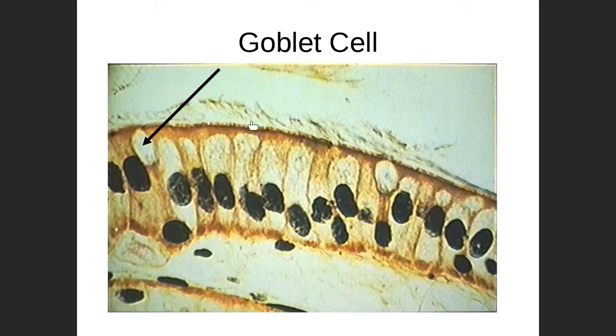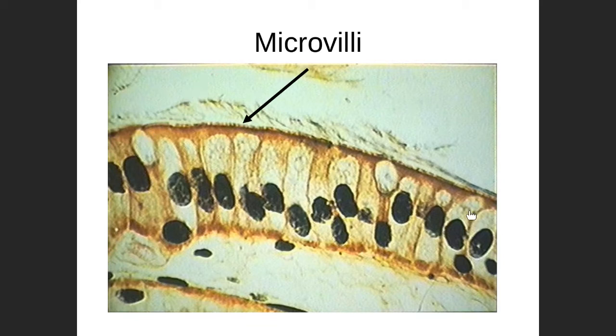Helps to add lubrication out into the digestive tract, and in some cases it helps with decreasing the pH. As you know, the stomach contents have a low pH and can be quite acidic, so the mucus can help to neutralize that somewhat. Then on this slide here you can see the microvilli, this little fin-like structure here. Tough to see, but that's the microvilli right here, also known as the brush border.